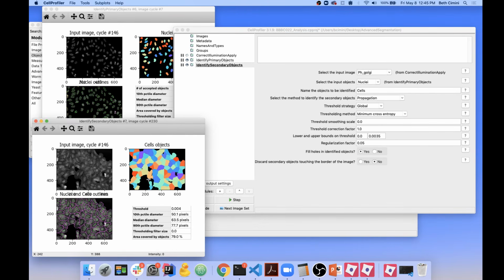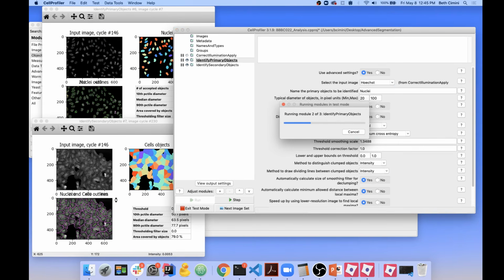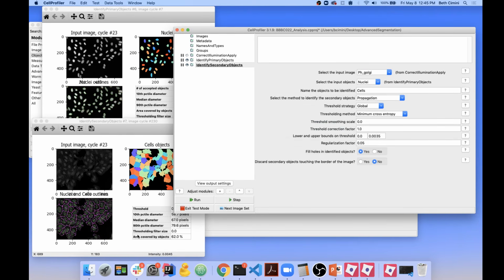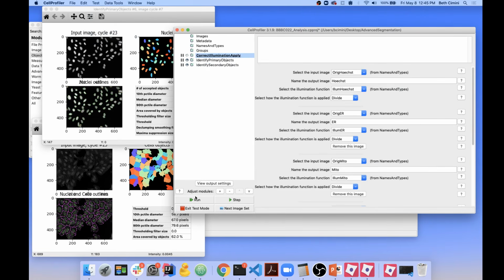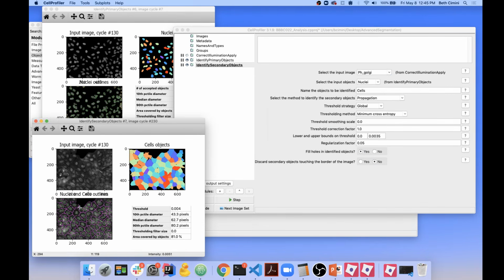Now again, this is something you want to do only when you need to, because in general, you want CellProfiler to be able to adapt to the robustness that's in your images. But when you consistently run into problems that can't be solved by any other solution, setting boundaries allows you to keep the threshold within a certain regime. Now, when I look at my nuclei and cytoplasmic thresholds, even in cases where there's very little background and there's a lot of signal, it stays within a value that makes the actual cytoplasm look good here.